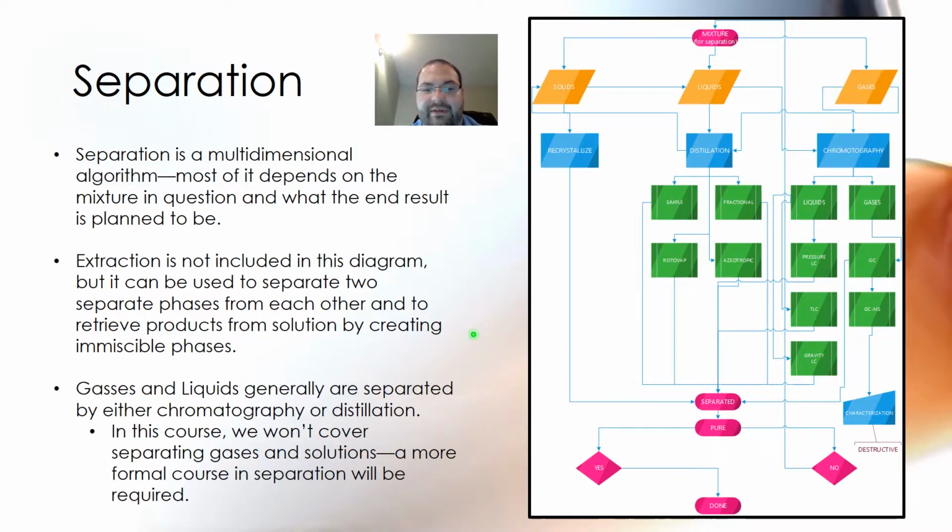Thin layer chromatography uses an eluent just like the other chromatography examples here, except that it works on a small plate made out of oftentimes silica trapped in an aluminum matrix or in between glass pieces.